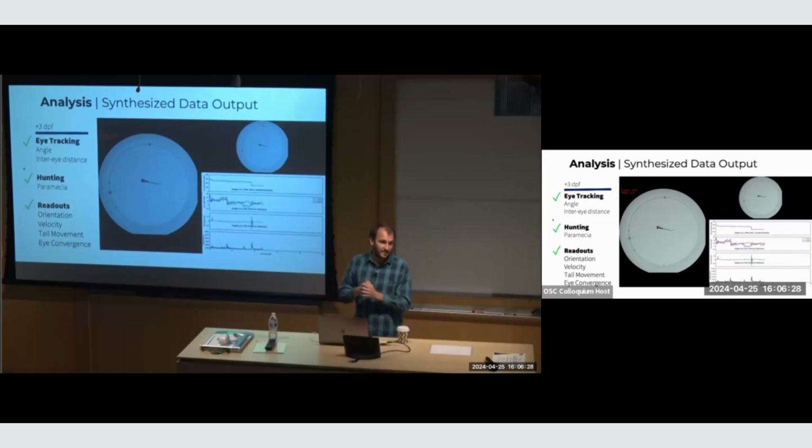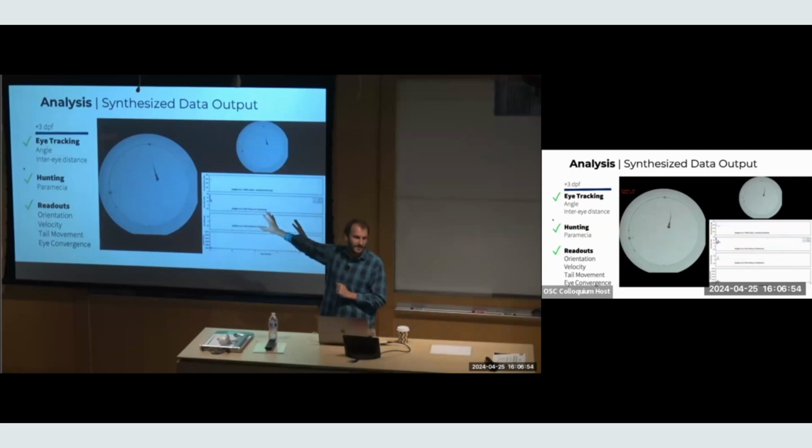That's 960 minutes. And so these fish come in, they're like 3 days old, 3 days post-fertilization. By the time you finish that raster, the first one was 3 days, and then the last one was 4 days post-fertilization because your whole experiment took a day, right? So your data is hard to interpret. And so essentially, the rastering approach in a lot of these high-throughput studies hinders video-based assays, hinders the ability to record and watch live dynamics, right? If that makes sense.